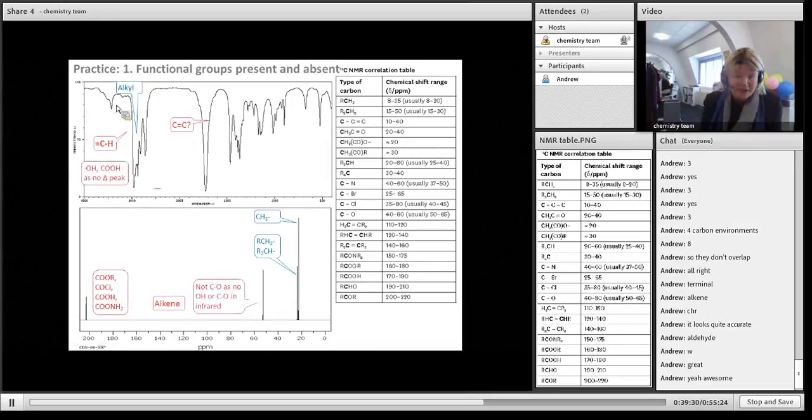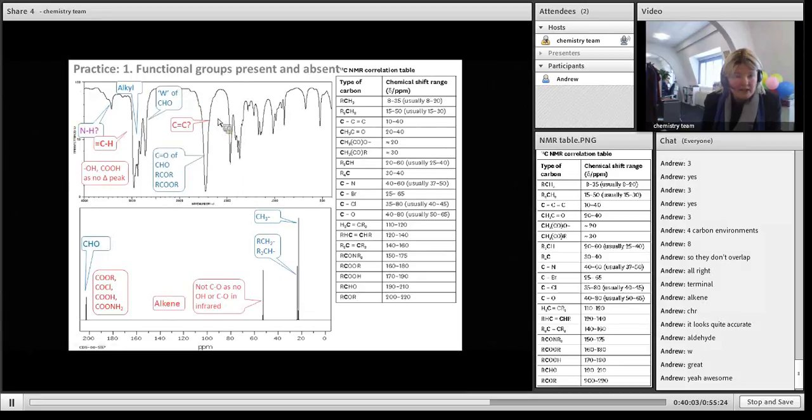So that's enough. Okay. And then you look further upfield, around 3000. There's no OH, or that may be an NH. Okay, we don't know. So it could be that. And we definitely have, okay, we're first doing this area. But we know there's no OH, so we know that this thing at around 52 is not from an OH, because we're not seeing anything here.